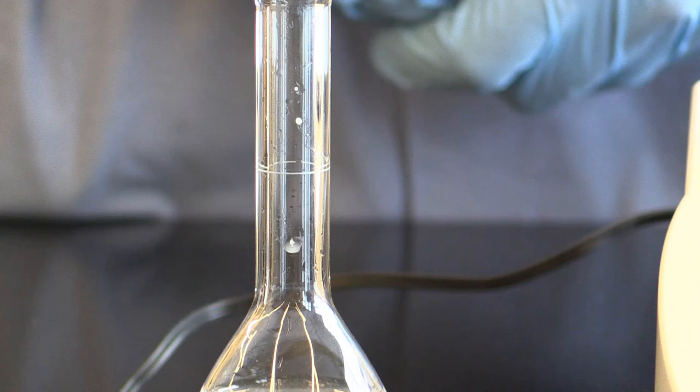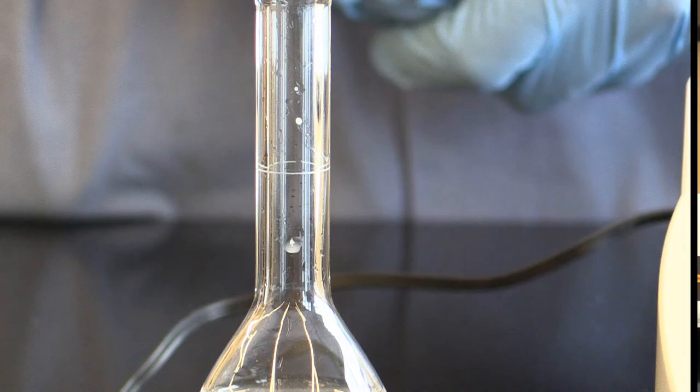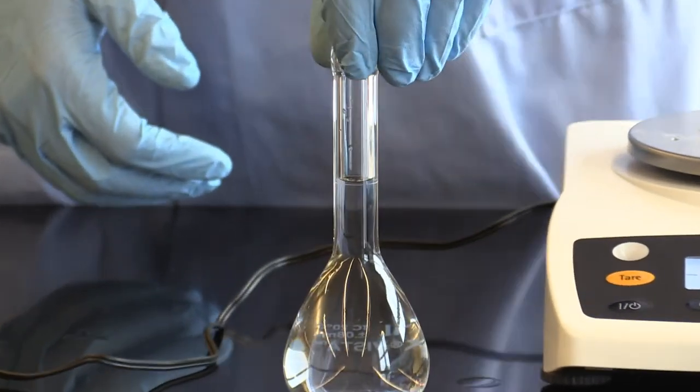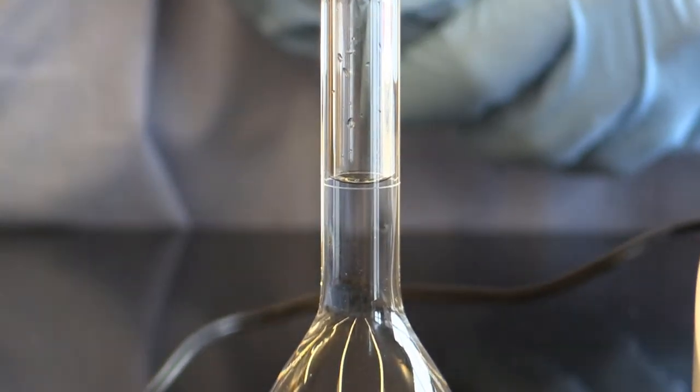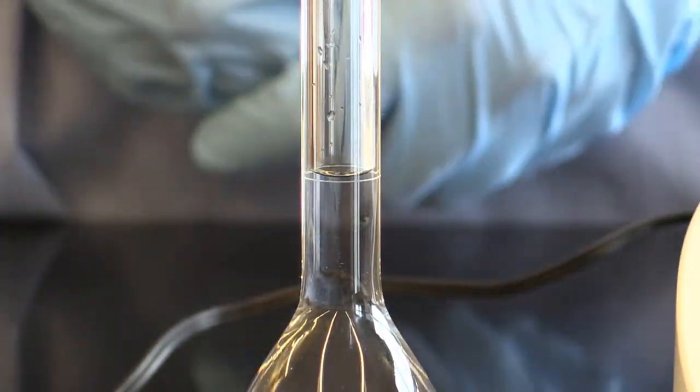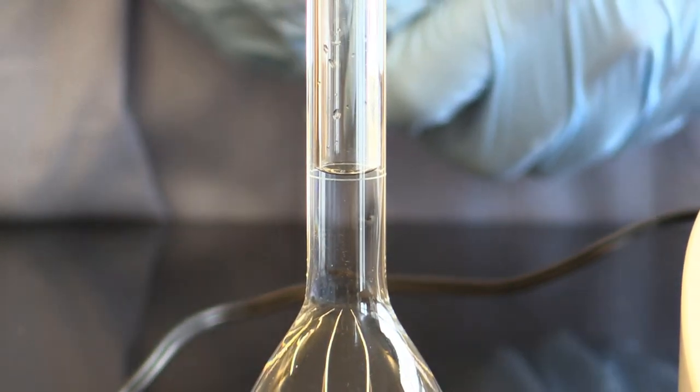You would either have to add a little bit more if the meniscus is under, or if the meniscus is over the line you will then have to redo it. So as you can see here, I have brought it up to the final volume, and that meniscus is touching—the bottom of the meniscus is touching that line—which means I don't have to repeat it.